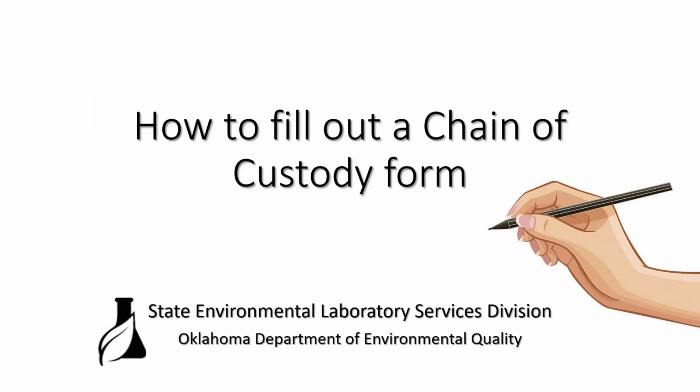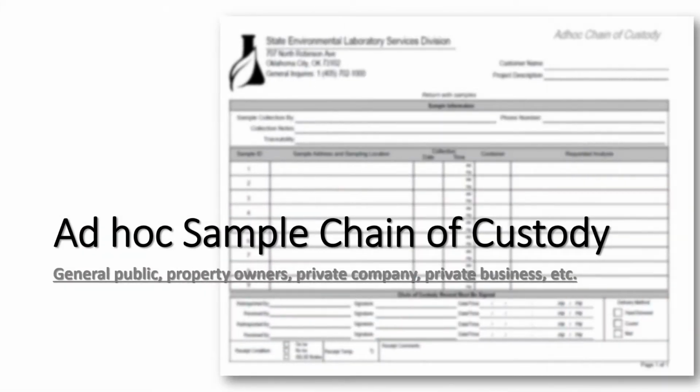Welcome to the training, How to Fill Out a Chain of Custody Form, brought to you by the State Environmental Laboratory Services Division. This training will describe how to complete an ad hoc chain of custody.